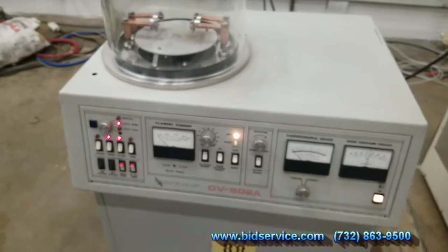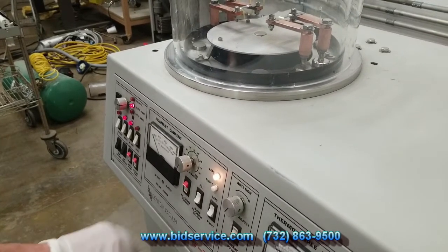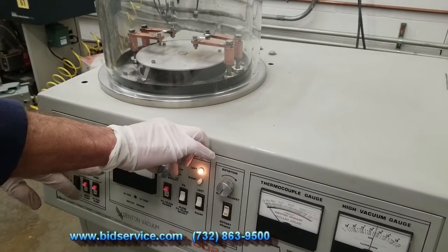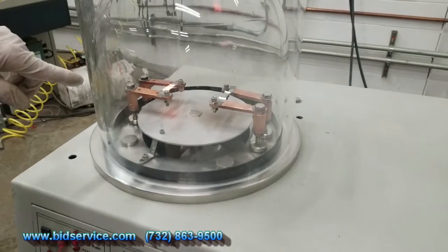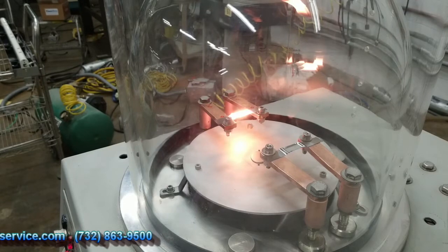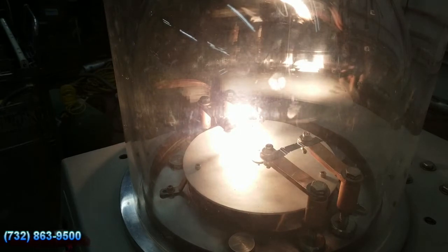I'm going to light up each one of the filaments individually and show you that they are operational. I'm on the left side now, so I'll go ahead and turn the filament low power on. Now I'm going to increase the current — you can see it slowly increasing. You can see it's glowing around 100 amps. The boat is lighting up and heating up. It's about 150 amps right now, at about 60% power.